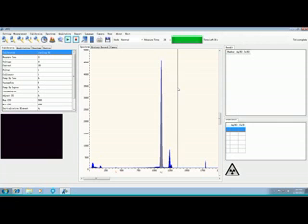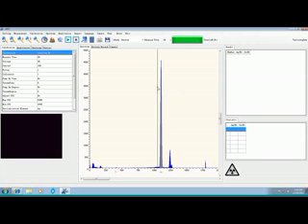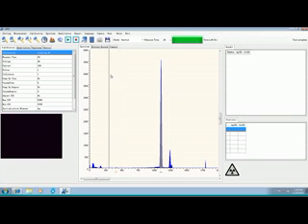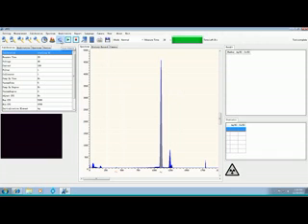Okay, now all you have to do is just click on the icon up there, the matching icon. If you don't know what it is, as you scroll across them and hold your mouse on it, it'll actually tell you underneath what it is. There you go. That's the one. Click on that.